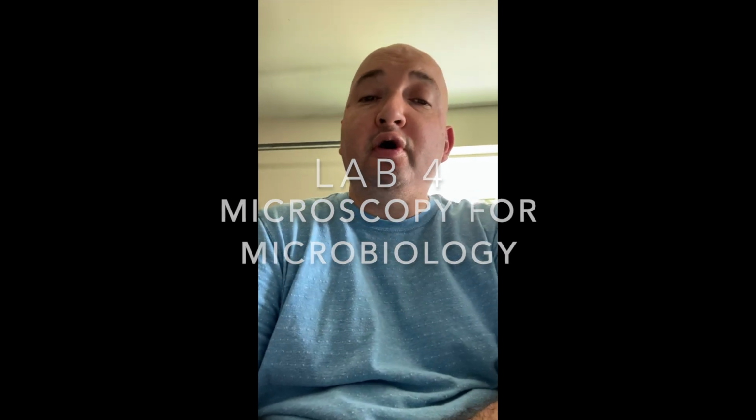My name is Ricardo Sandoval, and this video is for week 3 of Biology 225, Microbiology at Los Angeles Pacific University for the Summer 1 term. And this week I'll be talking about Lab 4, which is titled Microscopy for Microbiology.